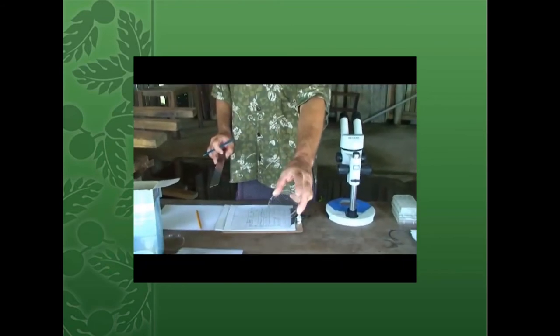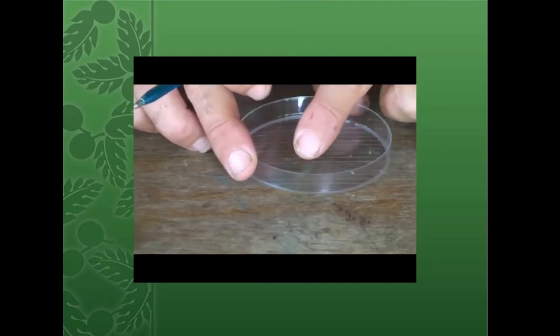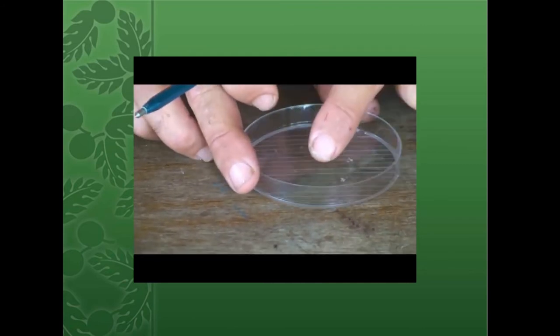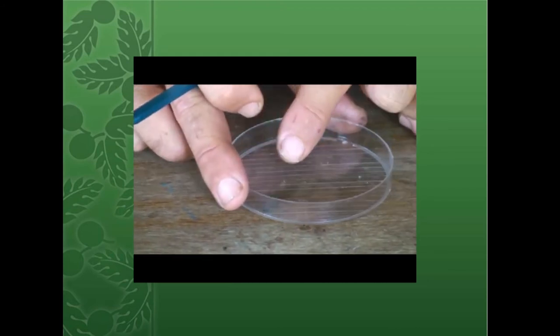Basically, you end up with a little squirt glass, and then when I'm moving it under the microscope to count, I'll just move this one under the objective, and then just zigzag back and forth, trying my best not to shake eggs across lanes.